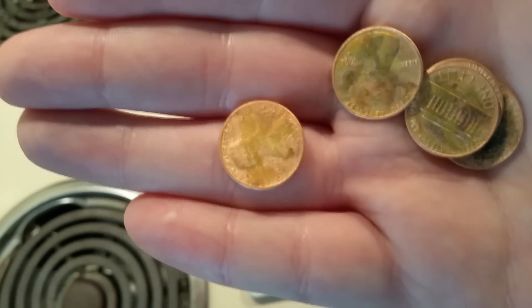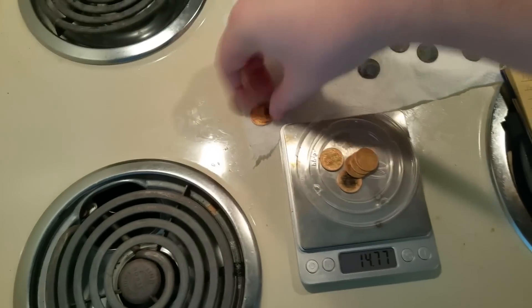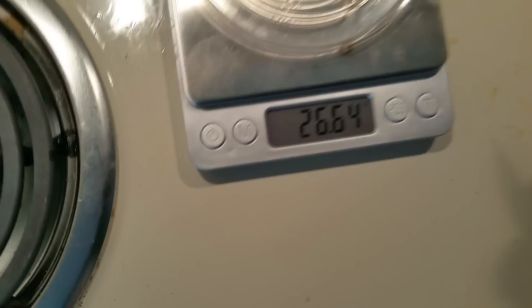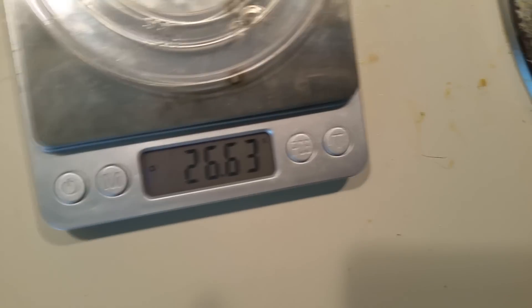I also tried an electrolysis experiment, but it kind of failed. I ended up plating something in copper rather than actually removing it, and I don't have much experience with electroplating, so we'll leave that for a time when I understand it a little bit better.